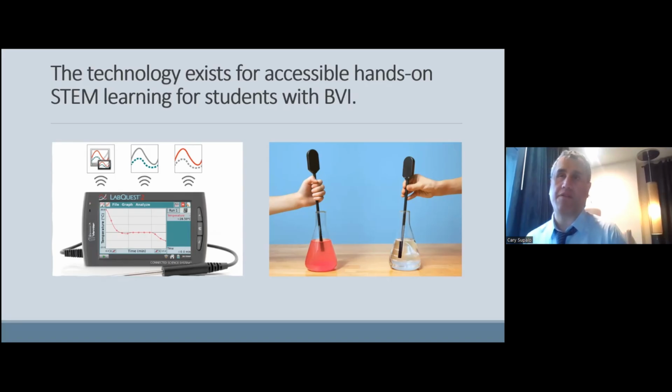I recently talked to some colleagues at the American Chemical Society conference. They were excited to learn the SALS is now available because they feel when they do lecture demonstrations for sighted kids in a large audience, if you're not seated in the first 4 or 5 rows of the audience, you're in essence blind to what's happening color change-wise on a bench top in the front of a large lecture hall.